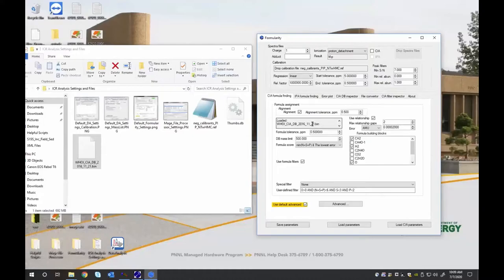So once you do have that database file loaded, all you have to do is drag and drop it into the load DB files box. Once you have that loaded, click CIA. You'll see a nice little alluring green box up here.